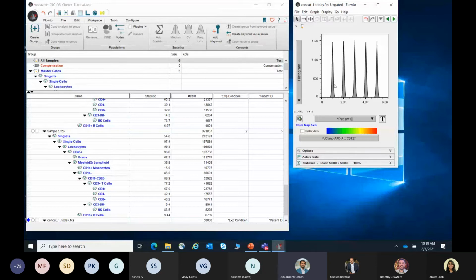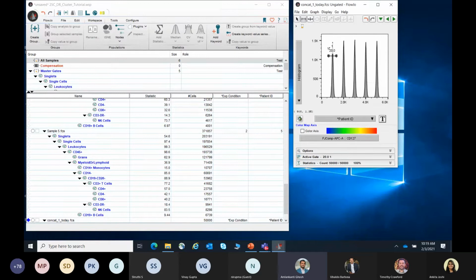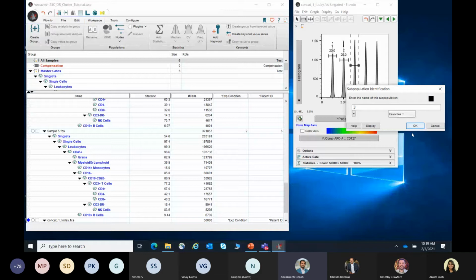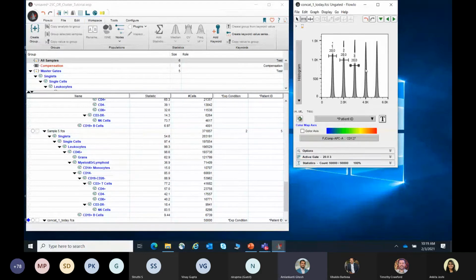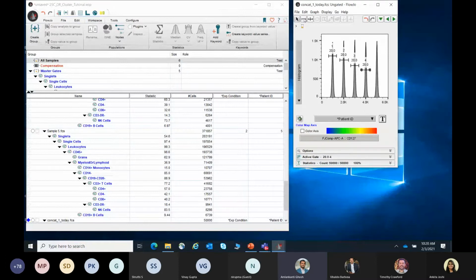So now I will use the range gate, which is a standard option here, to gate these individual conditions. So I'll click on that and go selecting each one of them like this. This is my patient 1, so I'll just click 1, which is obviously 20% of the total, and then go to number 2, then select the third one, go for the fourth, and there you go.